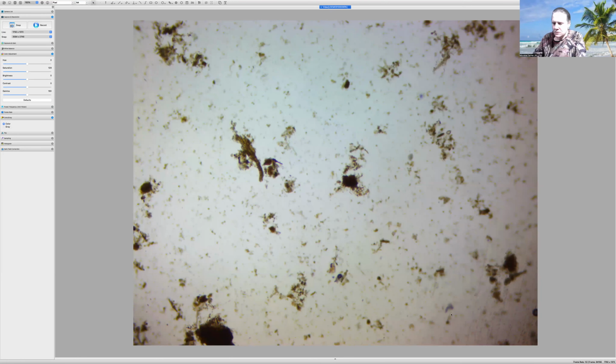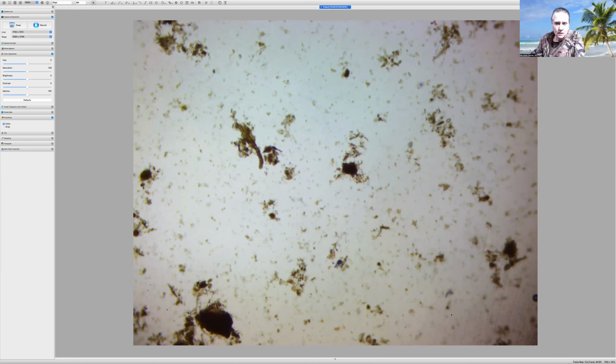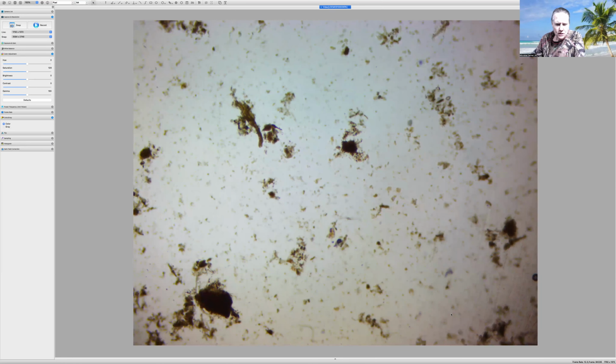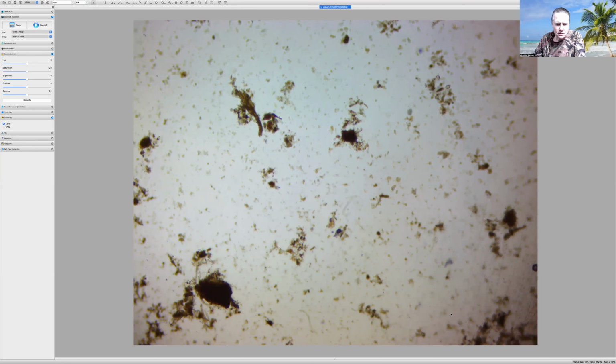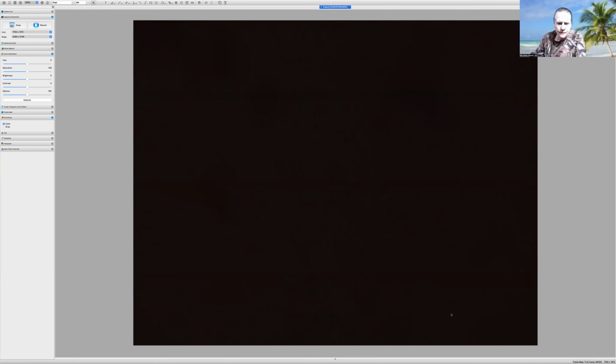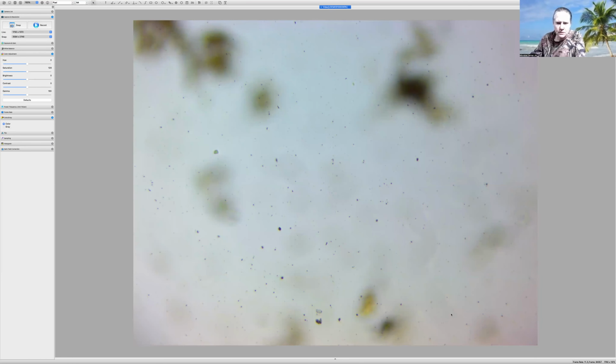So we are going to zoom in to look into that a little more. I should not have low oxygen. Oh, we're in water, so it's definitely low oxygen, but I shouldn't be increasing my ciliate levels at all.